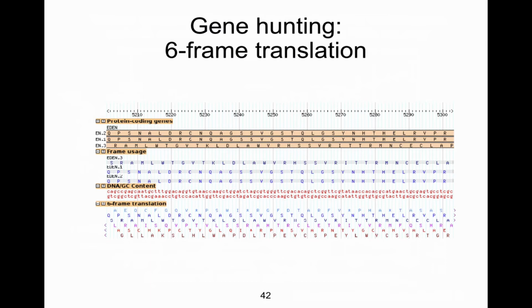So, when we consider applications like 6-frame translation searches, which are commonly used, for instance, in bacterial genomes that are not that complex and are quite limited in size, they've always been feasible due to the fact that there are not that many different peptides stemming from such a search. On a human genome, on the other hand, this is not true anymore. The number of peptides stemming out from a full 6-frame translation of the human genome becomes gigantic.